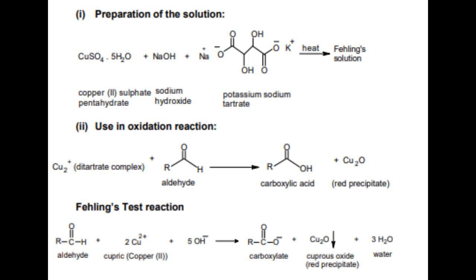Procedure. About 50 mg or 2-3 drops of the compound is taken in a test tube and 3 to 4 drops of Schiff's reagent are added to the test tube. The appearance of a dark pink or magenta color indicates that the compound is an aldehyde.